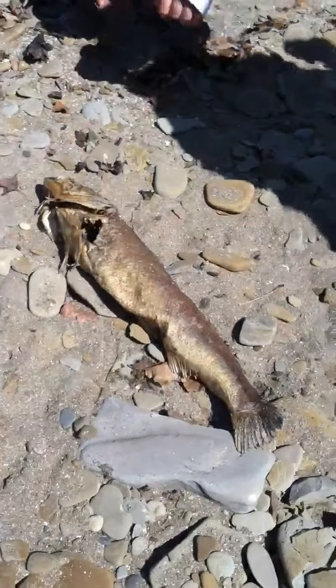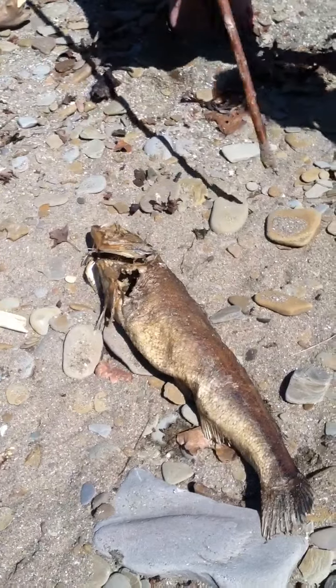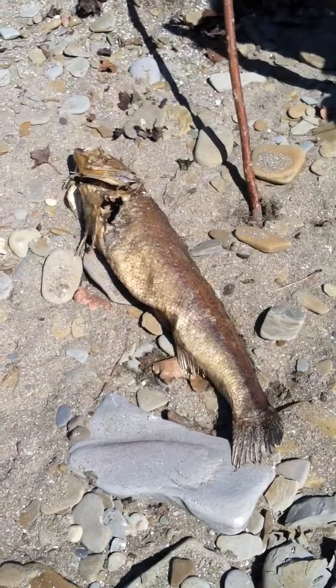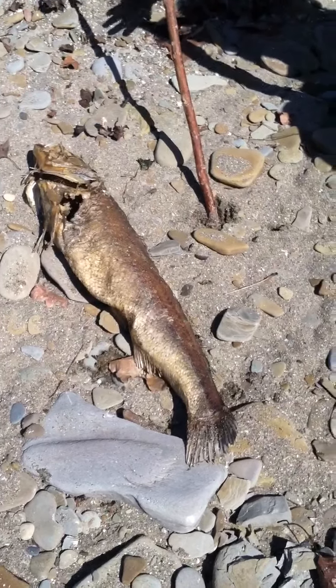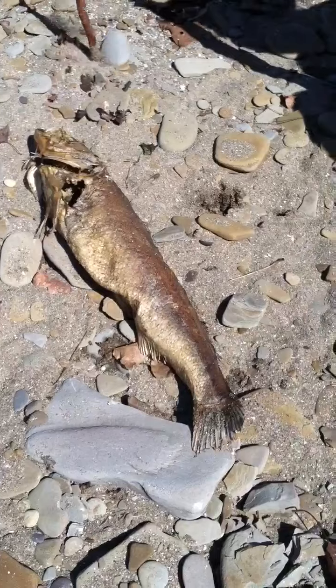Hey guys, we've been getting a lot of requests for this one and today we're gonna teach you how to dissect a fish. It's basically a step-by-step tutorial of what you need to do and the proper way to dissect the fish — and how to be safe. Safety always counts.